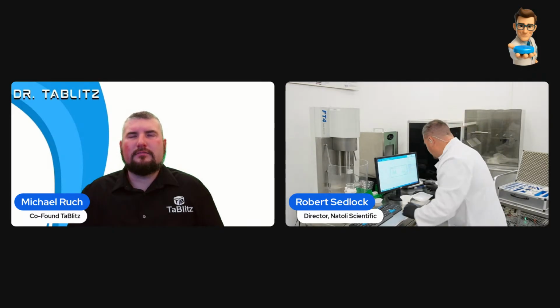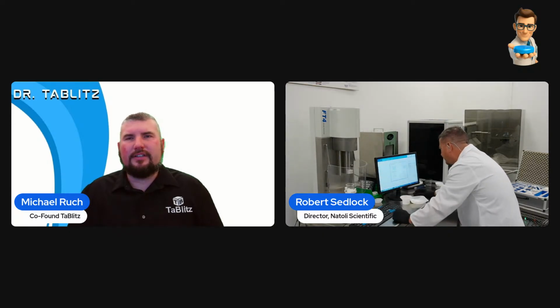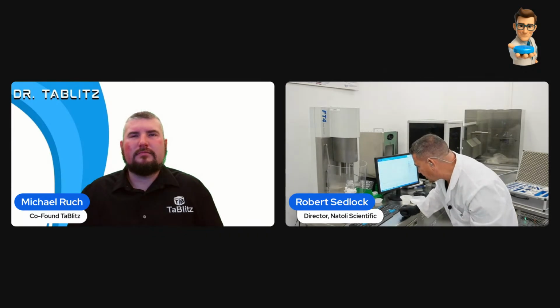Okay. So let me hit the start button here. Does this also tell us things about cohesion as well? Yes, we're going to talk about cohesion, adhesion. Here comes the piston here. This is a shear cell.